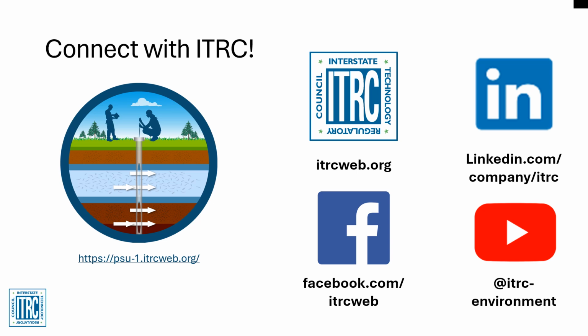Remember, you can learn more about the fossil fuel sampler and others in the ITRC Passive Sampling Update online guidance document.